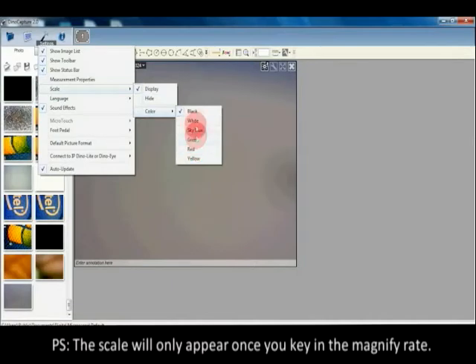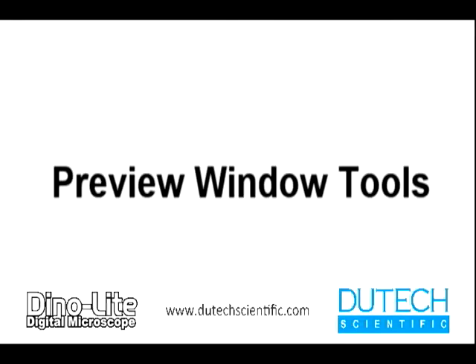The scale will only appear once you key in the magnification rate.